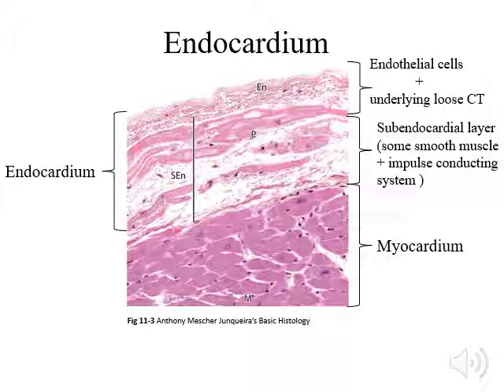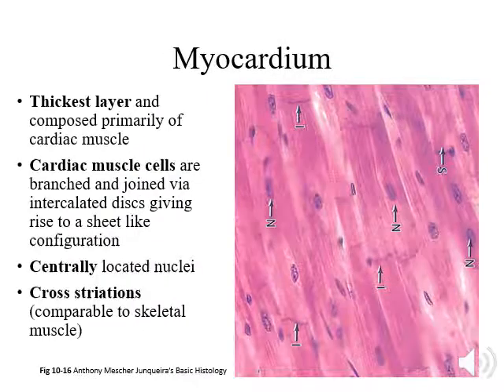So in the inferior aspect of this image, we see the deep eosinophilic or pink color of the cardiac muscle. The myocardium represents the thickest layer of the heart wall. It consists primarily of cardiac muscle. You will recall that cardiac muscle, similar to skeletal muscle, contains myofibrils all in an organized layer, giving rise to a striated appearance. Now, contrary to skeletal muscle, the cardiac muscle tend to only have one nucleus, sometimes two or three, but typically one, and it's centrally located.